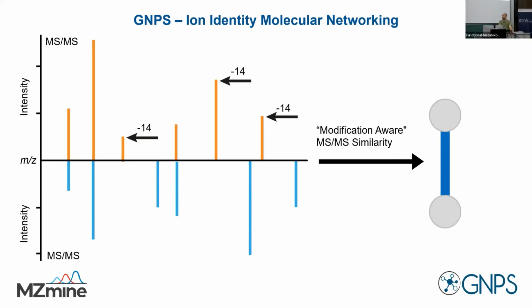It's the same neutral loss. We cut off the same branch of the molecule. That's why we keep the modification in the ion, and the other way around, we cut off the modification. So of course the parameters are the same, right? So there are still ways we learn to explain it.